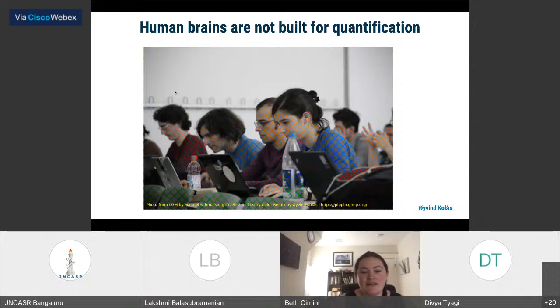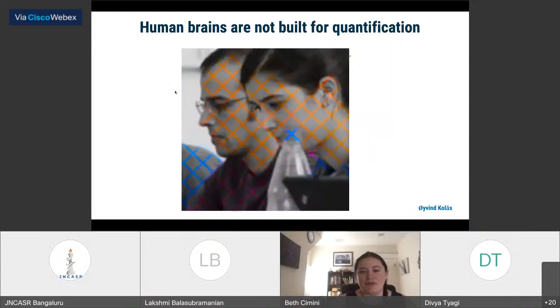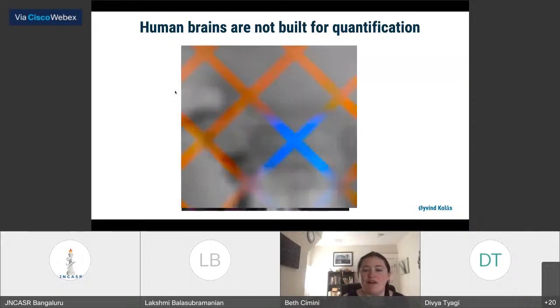And so even in cases where you have a phenotype that you think is readily quantifiable just by looking at it, we really advocate for people to use these automated image analysis tools, because they provide more information, they provide quantifiable information, but also because your brain is not actually a very good quantification machine. And so that's why in our group we're very dedicated to building these easy to use, easy to get going with open source image analysis tools, because we generally never want someone to be counting things by hand. We always want people to be quantifying within software.